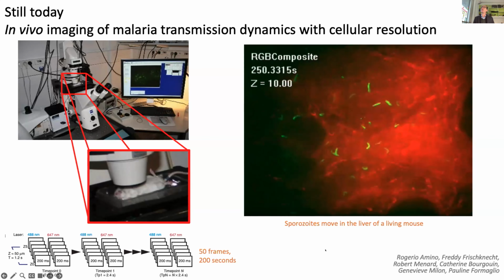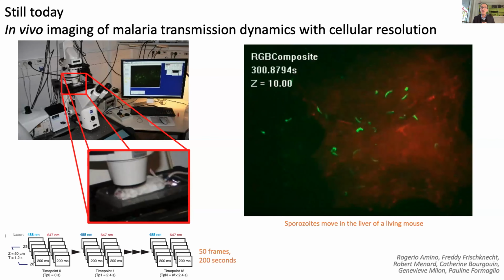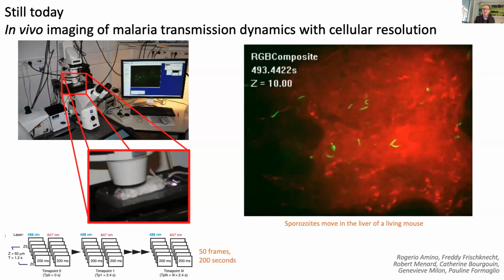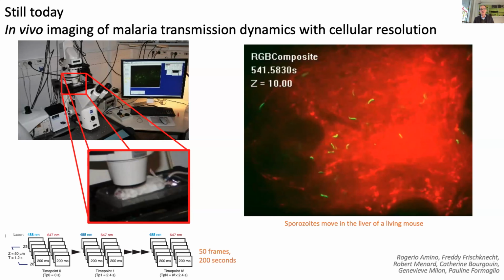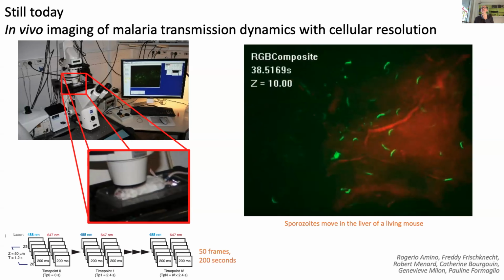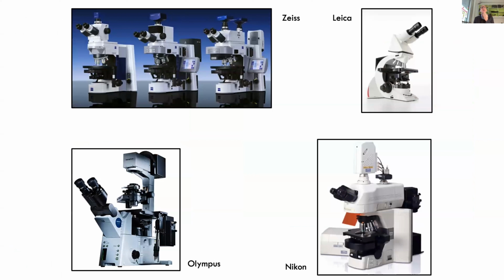And imaging gives you a direct insight of what's happening, what are the dynamic processes of infections at the single cell, single bacteria, or single object level. I think this is unique, right? And this is fostered by these beautiful devices called the microscope. Now, again, that might be a little bit distant from what you do in ANERIS.